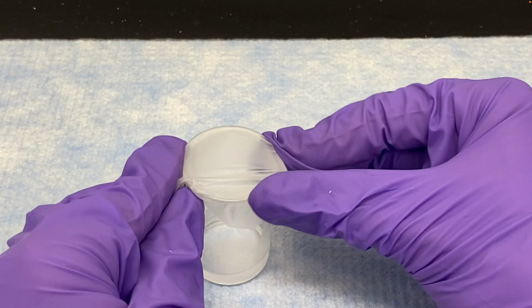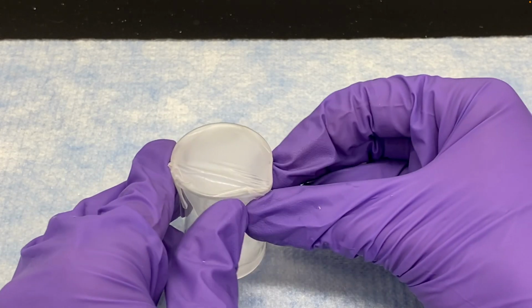Now after that's dried, for our lab, you're in a position to run an IR spectrum. So you can take a Pasteur pipette with a bulb attached, and put a drop of this on the top of an IR spectrometer and see what functional groups you have in your molecule, whether the reaction actually happened.